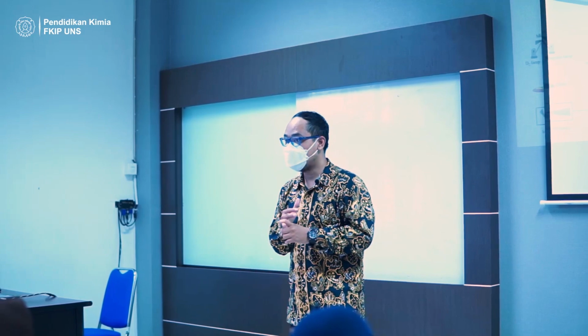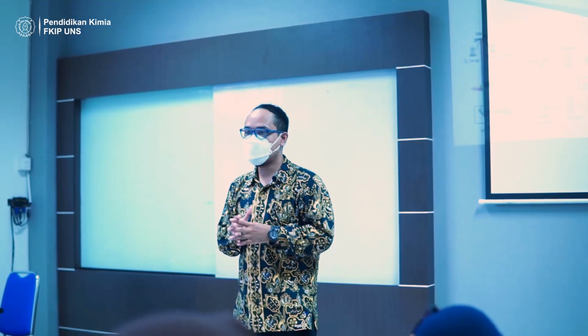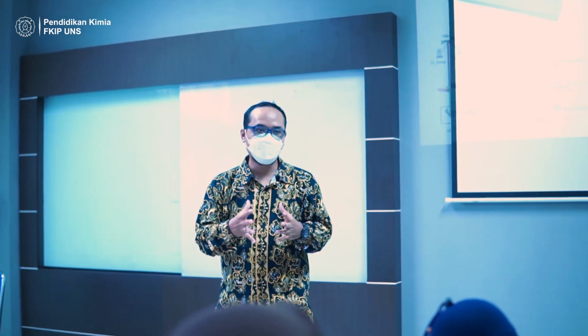Thank you very much. Yeah, so we have already done the practicum in the laboratory. You have now experienced how to make pH indicators from natural products, how to test the extract in different solutions with different pHs, and how to use a UV spectrophotometer to measure the maximum wavelength of each solution at different pHs. Now we will start the practicum in the laboratory.